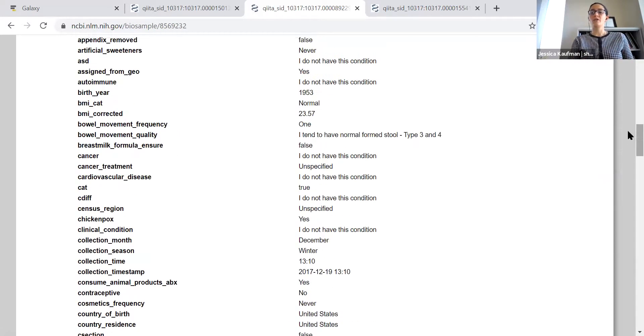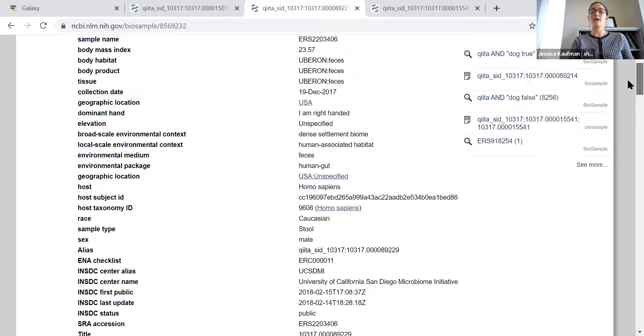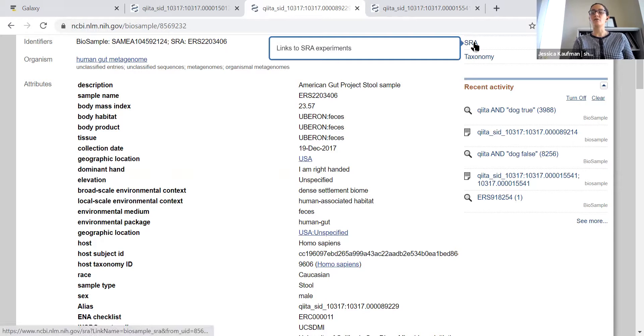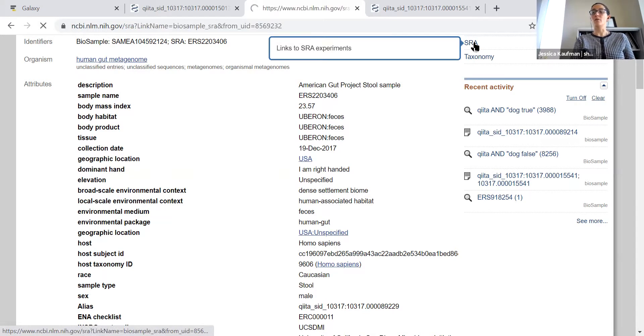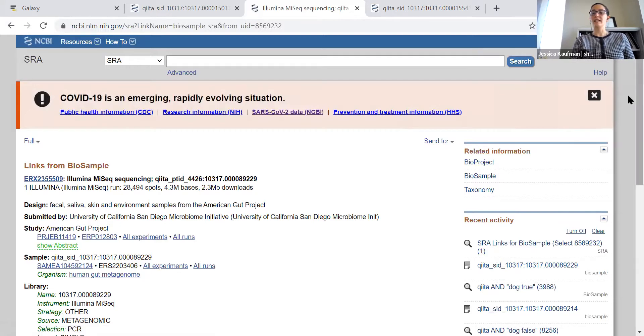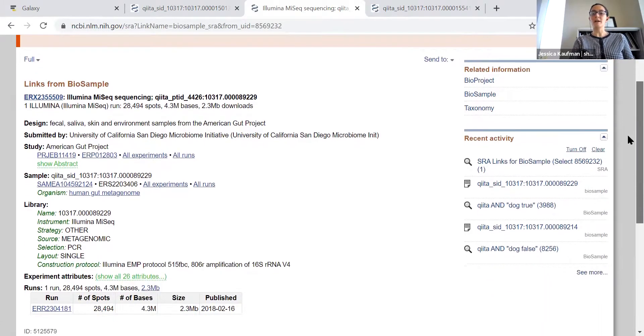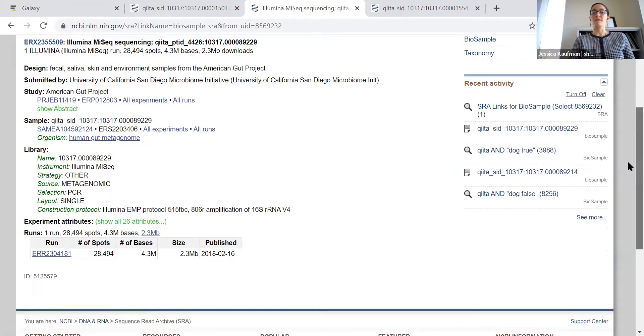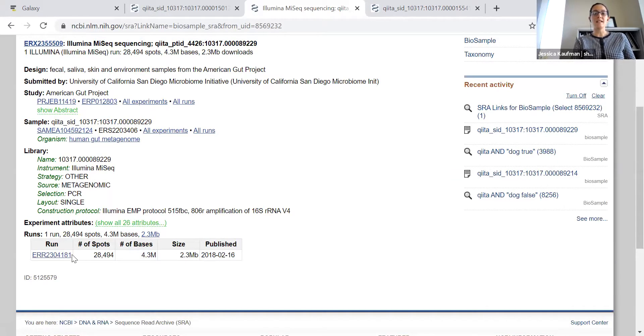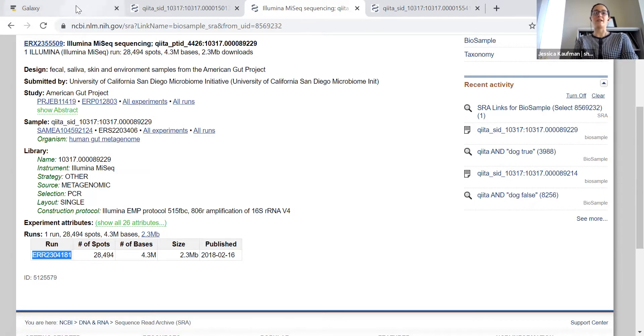Once you find those two people, we're going to go from this survey question to the short read archive to get the code for the FASTQ file. You can see here, this is a description of the experiment. The sequencing was done on an Illumina MiSeq. And this number is the link to import the FASTQ file.